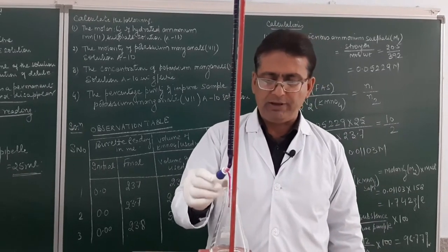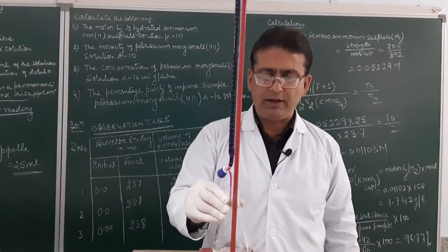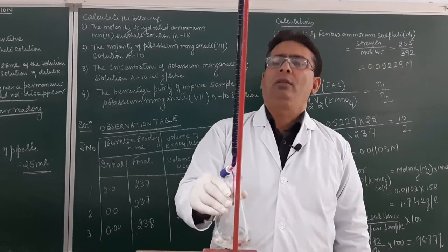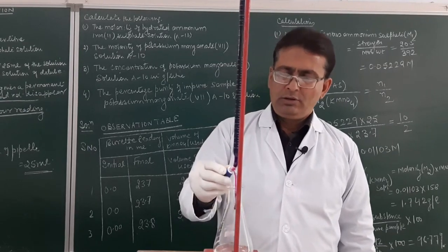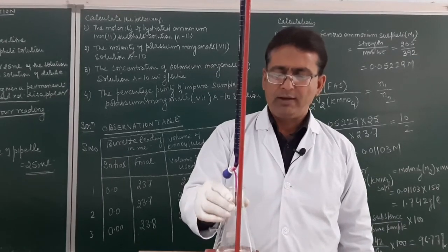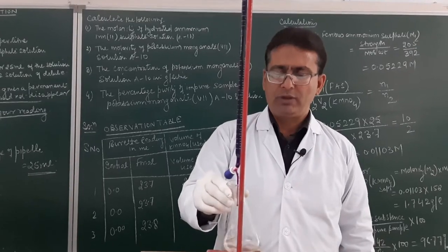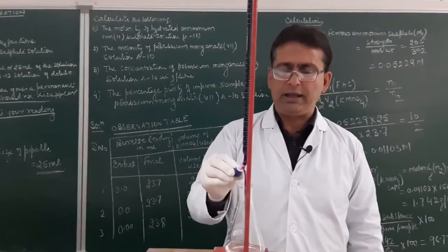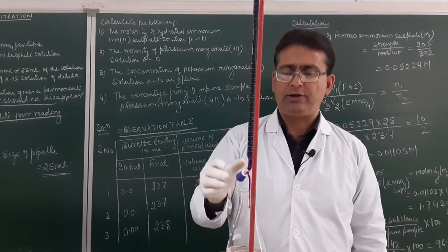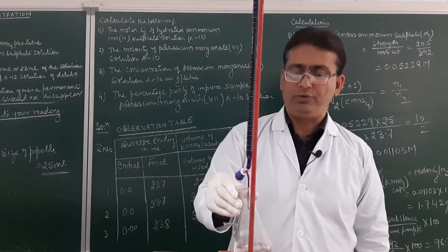Is it clear? The color must not get decolorized by shaking. And whensoever the persistent pink color is obtained, that will indicate the end point of the titration.